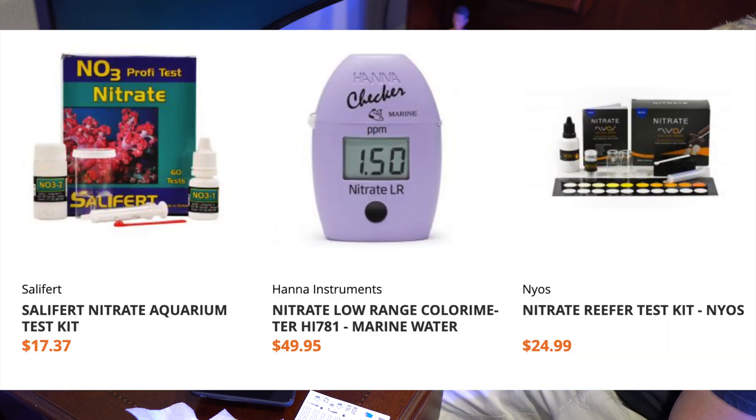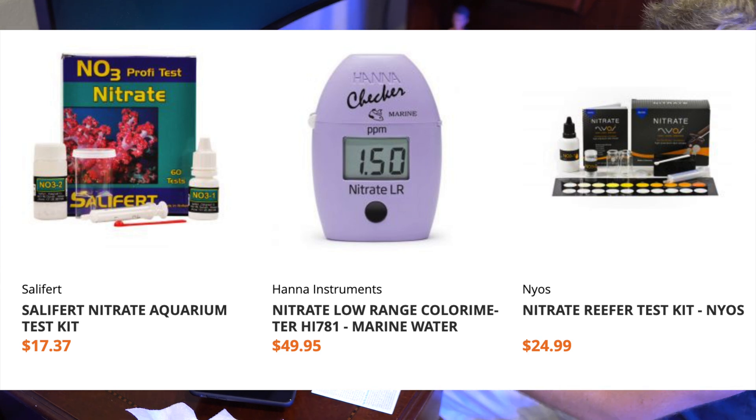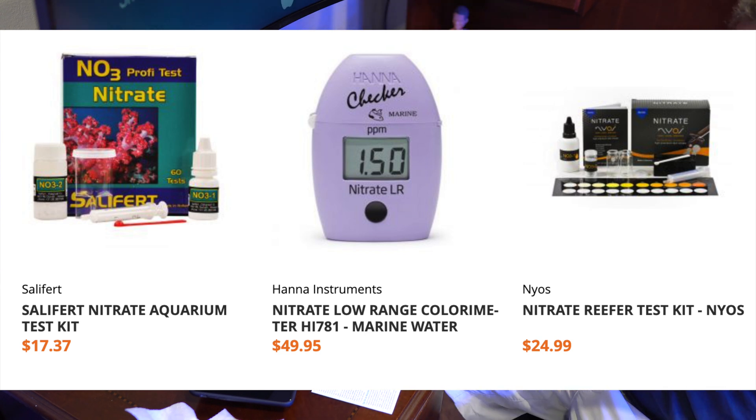The other big thing to consider is price. Relative to the other two most popular nitrate testers, you're going to be paying double, if not more, for added accuracy. And that accuracy comes at the cost of something that's more complicated and more time-consuming to actually get a result.